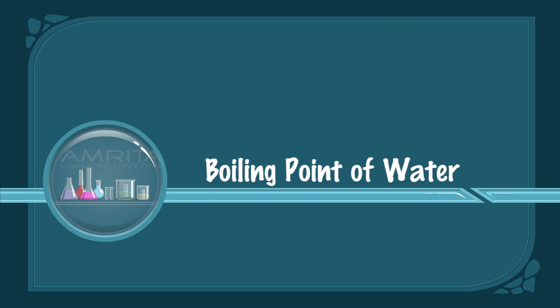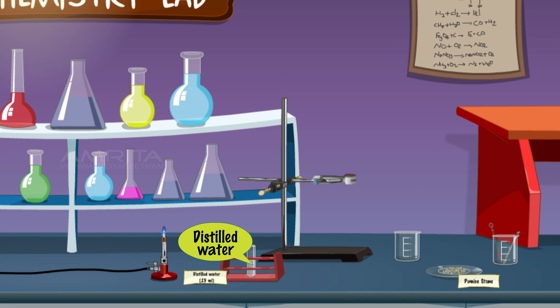Boiling Point of Water. We require distilled water, boiling tube, beakers, thermometer, a spatula, pumice stone, a stand with a clamp and a Bunsen burner.